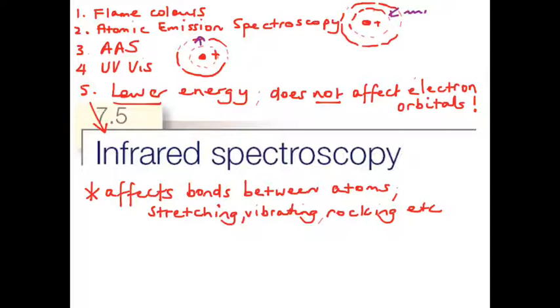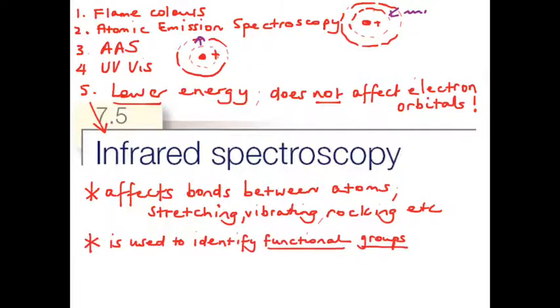And when you input enough of the right energy, the right frequency of energy, which is resonant with the particular bonds that you are exposing, energy will be absorbed. And that's what we're looking for in this technique. It's used to identify functional groups such as the OH group, the CH group, the C=O group. That's what we're looking to identify.